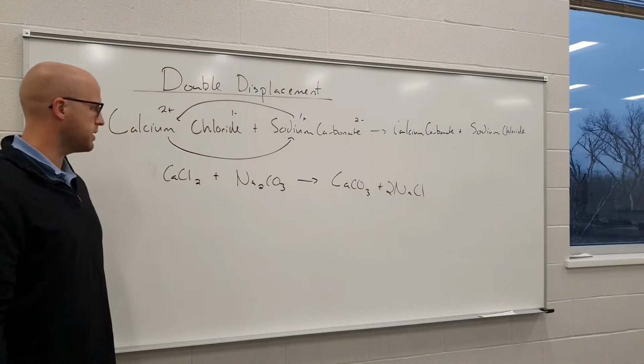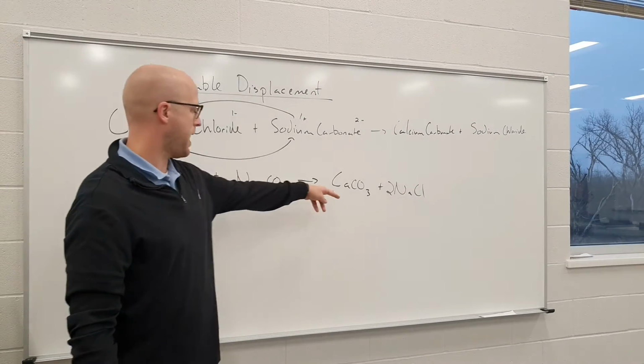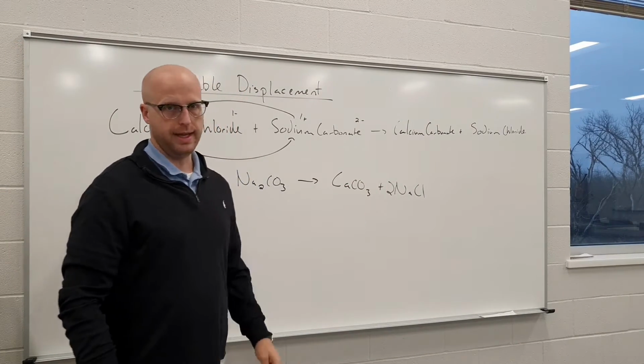Okay, so here's the reaction we're going to see today, a double displacement. We're going to start with calcium chloride and sodium carbonate, we're going to react them, and we're going to get calcium carbonate and sodium chloride.